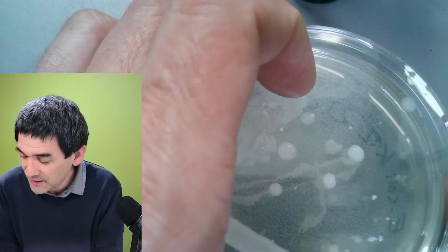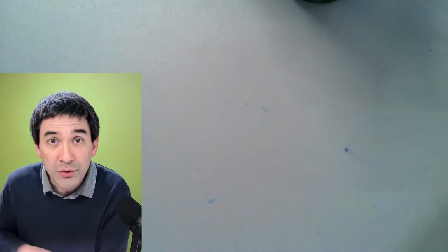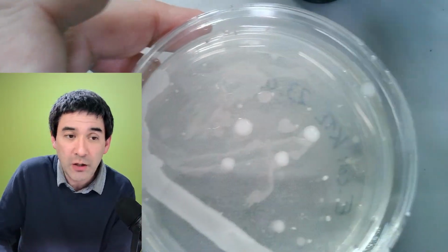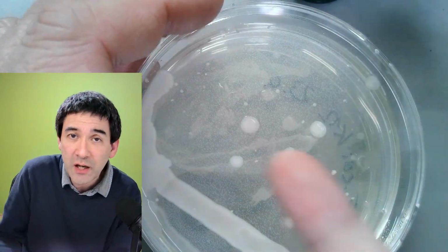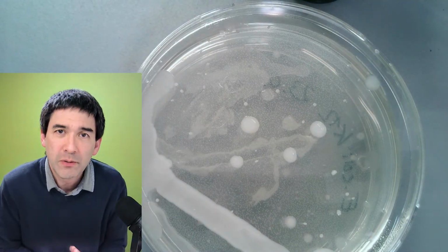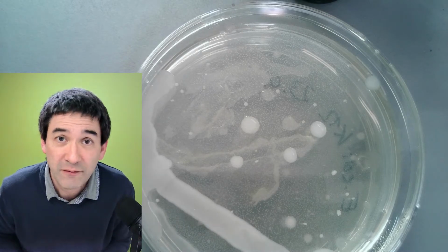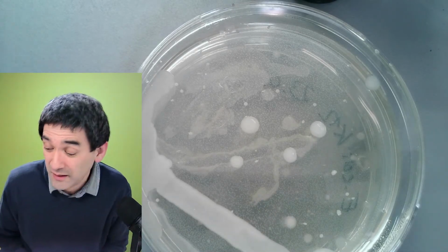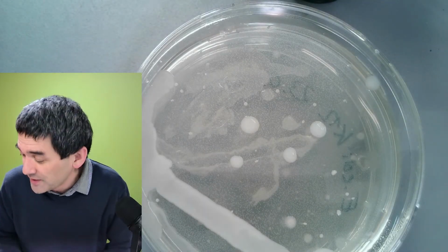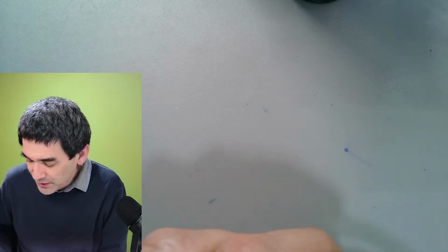Okay, so I'm just saying this because I've seen on YouTube channels where some people just basically make those agar media, they make fingerprints to see how many bacteria there are. And I say, no, you don't want to do that. You don't want to grow your own bacteria because these are, I don't know, Staphylococcus maybe? I have no idea, right? You want to be careful, especially if they're able to grow on the human body, right? So just saying, yeah. So this will be our source for bacteria.